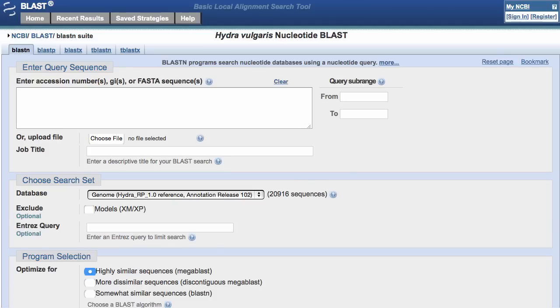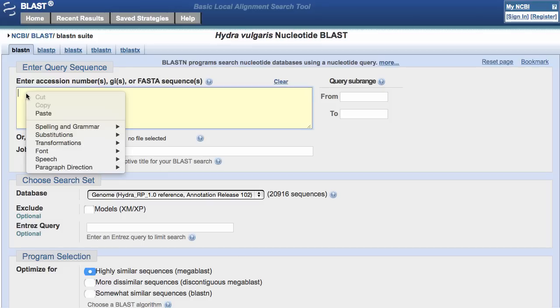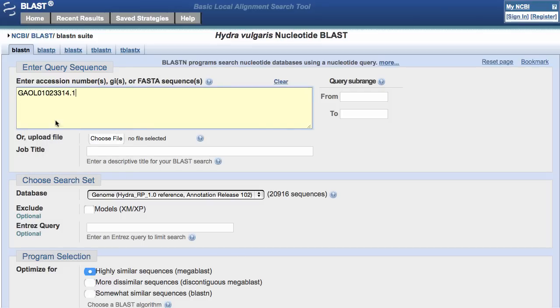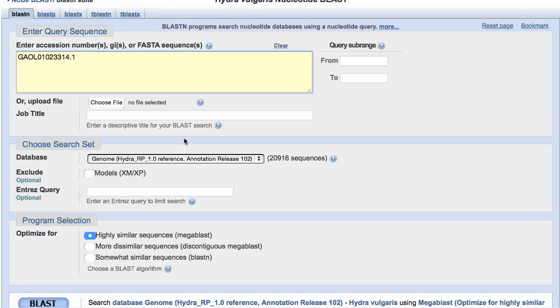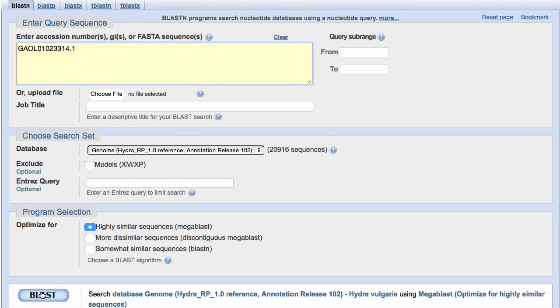Now I'm going to paste in an identifier from a TSA project — TSA means Transcriptome Shotgun Assembly. I'll grab that identifier and simply paste it in here, then scroll down to the bottom of the page and hit BLAST.